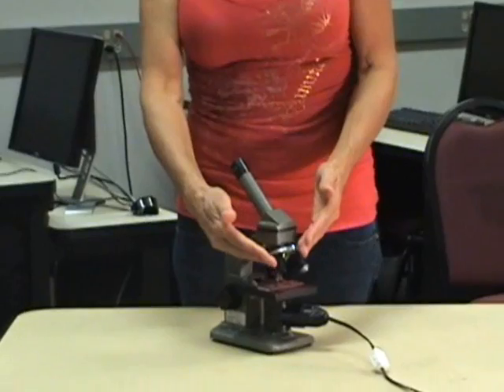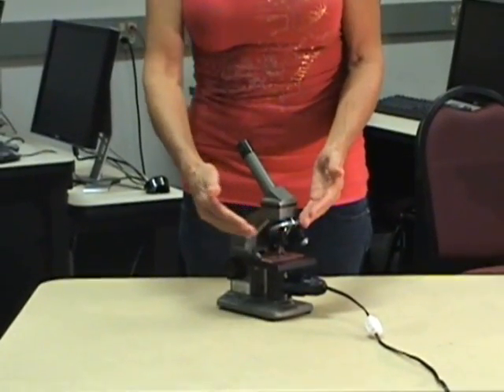This part up here is the eyepiece — it's where you're going to look through. Next are the objective lenses. There are three on this one that go from low, medium, and high.